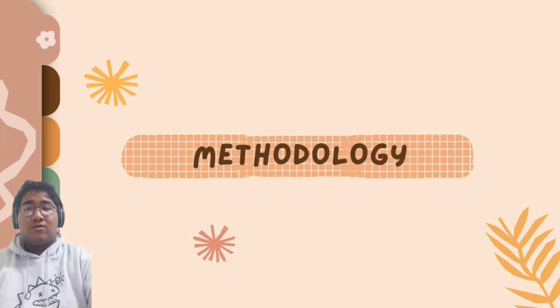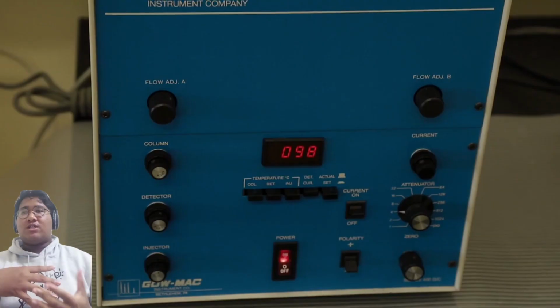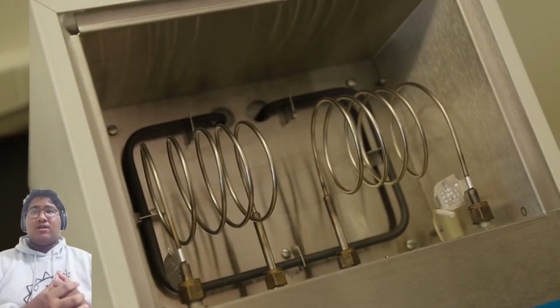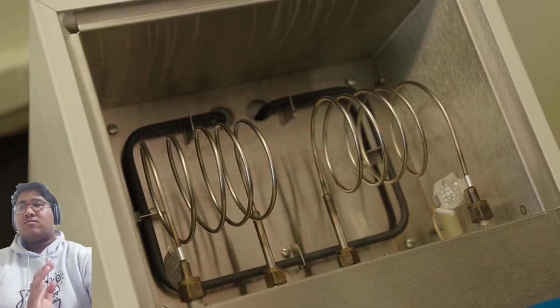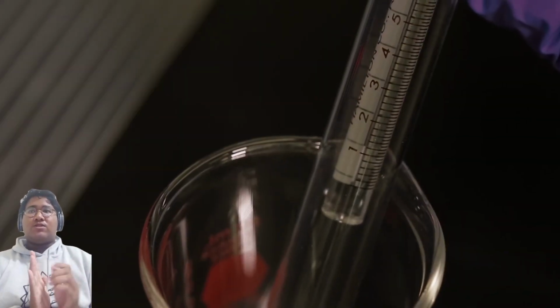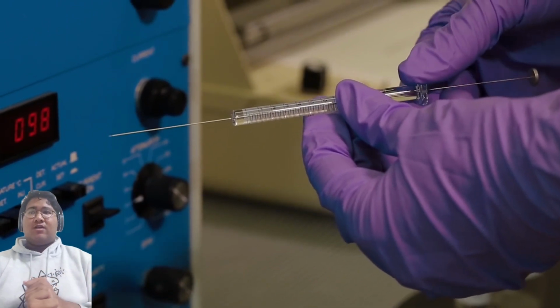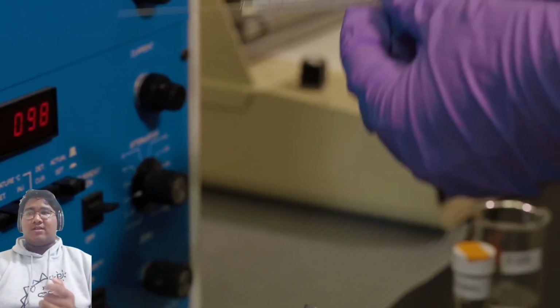Okay, for methodology, to perform gas chromatography, often called GC, we use a gas chromatograph. It is an instrument with a long column filled with small particles loaded with a very thin layer of an absorbent. This layer is the stationary phase of the column. To run a GC, you first need to prepare the sample for injection. Using a small syringe, collect between 1 and 5 microliters, followed by 3 to 4 microliters of air. Be sure that your sample is free of drying agent to prevent clogging the syringe.